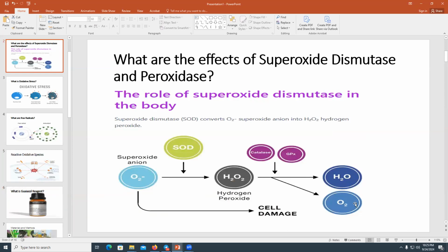Once Guaiacol, who is colorless and reduced, possessing electrons, binds to oxygen, it will no longer be reduced, it will now be oxidized. It lost the electrons because it gave them to oxygen. And now Guaiacol is no longer colorless, it will turn into amber color or brown color.